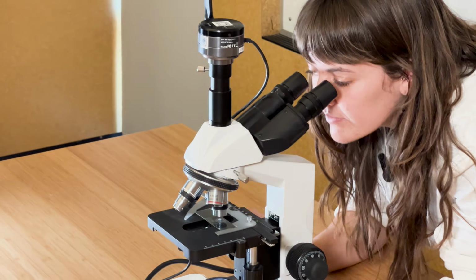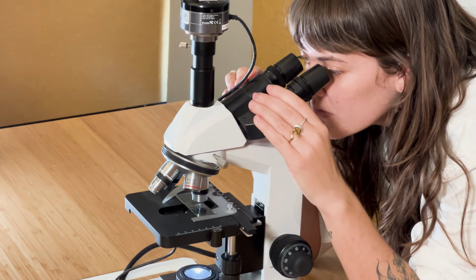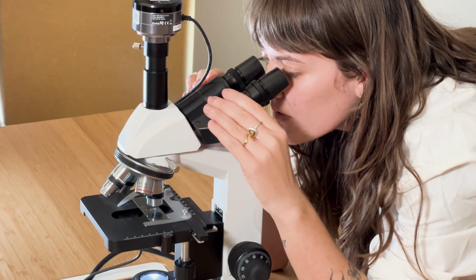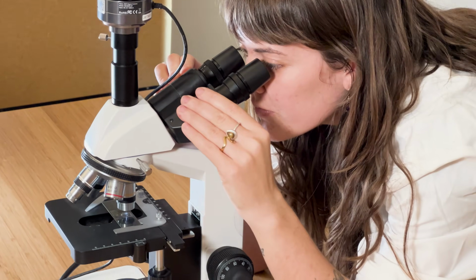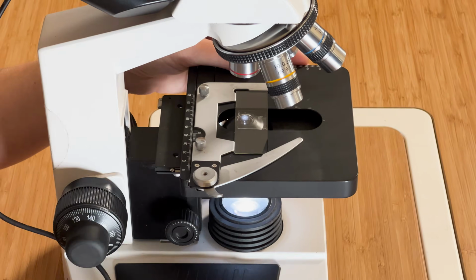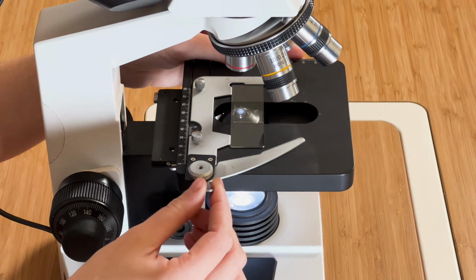Now let's get you started on learning about the parts of your microscope. You can adjust the horizontal distance between the eyepieces. Start by moving them farther apart. Look through them and move them closer together until you see one image. This part is the stage. The stage clip is where you place and secure your sample slide.